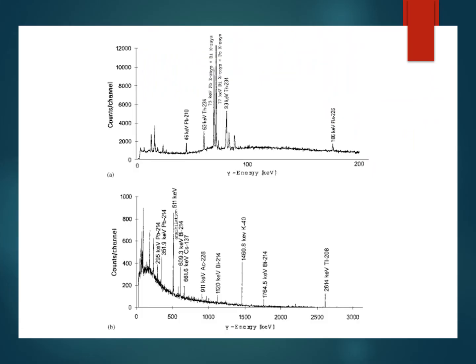So this is the graph in which the chemistry or the composition of neem leaves is being analyzed, and the peaks of different graphs are interpreted to determine different components or the composition of the elements in that particular part of the leaf. So this is the graph which shows the composition of different elements present in neem leaves.